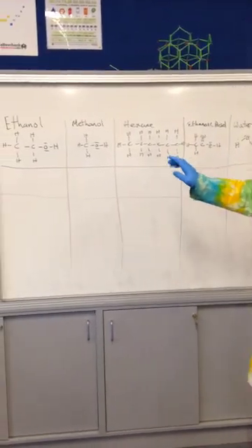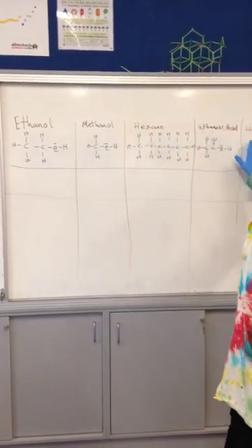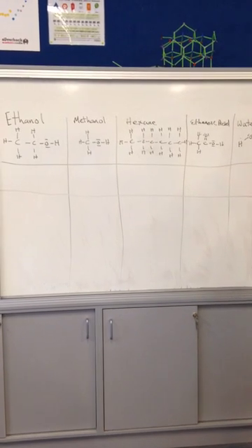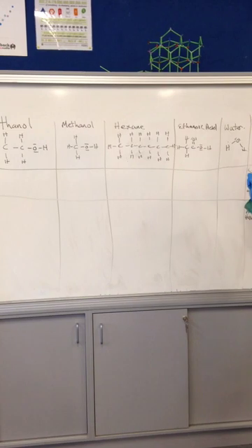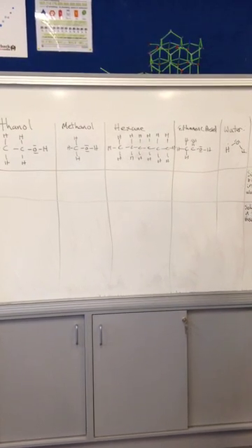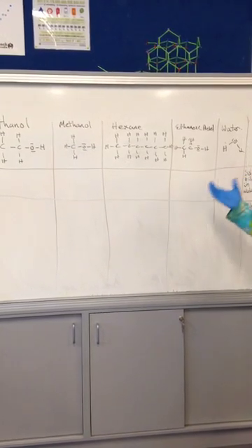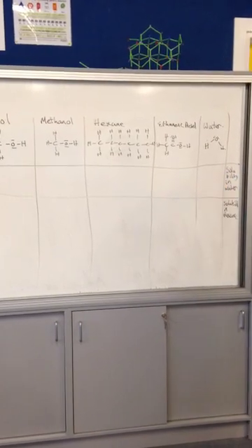And you need to look at the molecules and what atoms are in each of these molecules. And as you're looking at them, you need to be thinking about whether these molecules are going to be polar or non-polar, and why, and how that relates to their solubility, their electrical conductivity, and even their melting points and boiling points, although that's not a part of the demonstration today.